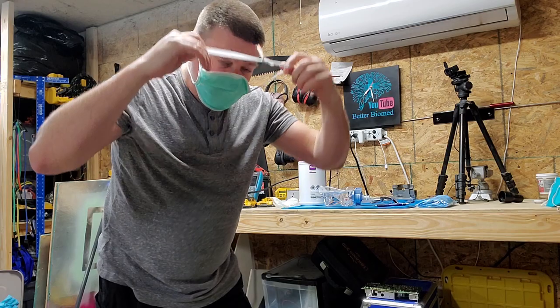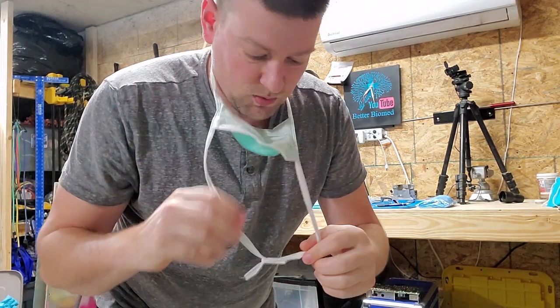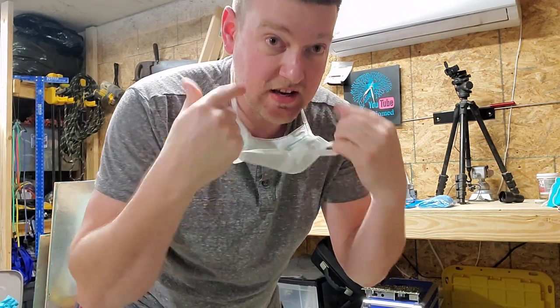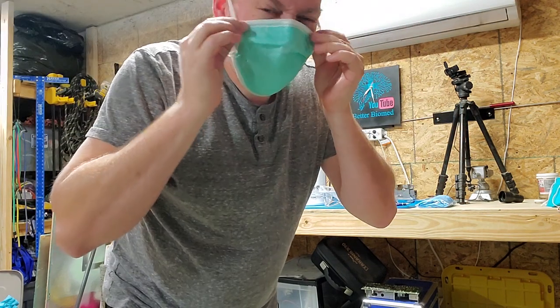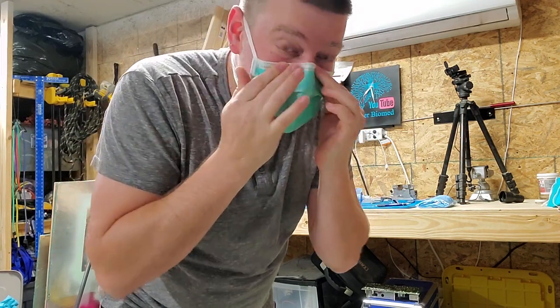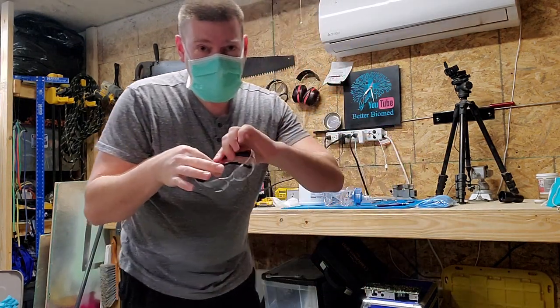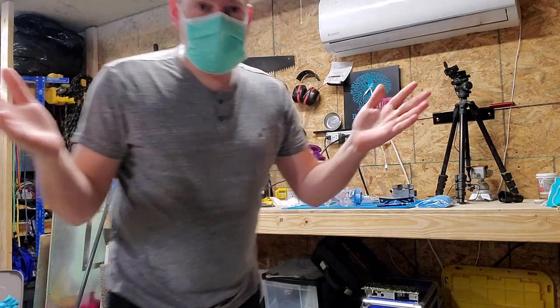I'm going to take my mask, because these are surgical masks, and this is what I usually wear when I go to work, because it's got an adhesive here that sticks really well to my nose, gives me really good adhesion. So this goes back on. I'm going to adjust it real quick. Take my eyewear, stick them back in my tool bag, and I'm going to go on my way.